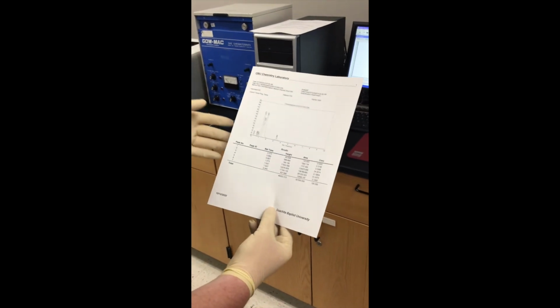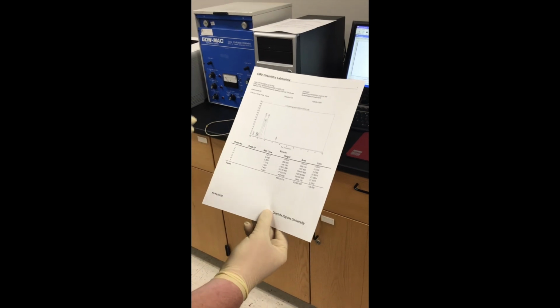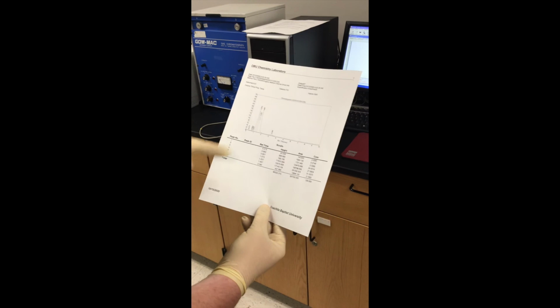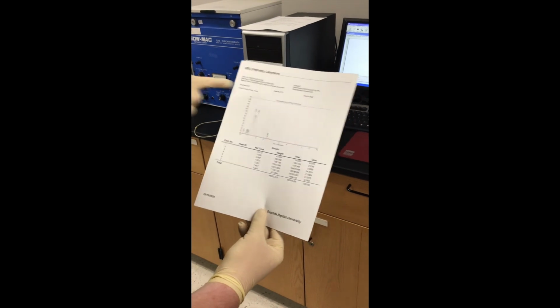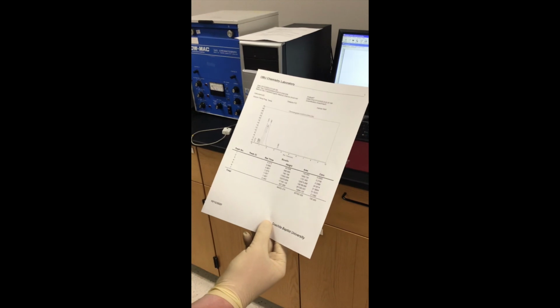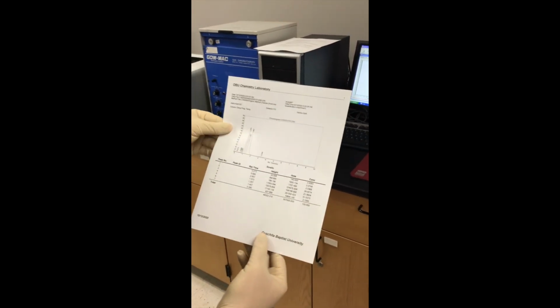Of course, the proportions are a little bit different, but all of the information is down here, and it tells you all the heights, all the areas, and then it automatically does your integrations for you. It calculates the area underneath so you can figure out your percentages of the stuff in the sample. And so this will do most of the work that you need to do. The name up here you can change for yourself. You can add all this extra information whenever you're preparing to print, and then once you're done, you will have this information for you to take off and go somewhere else.